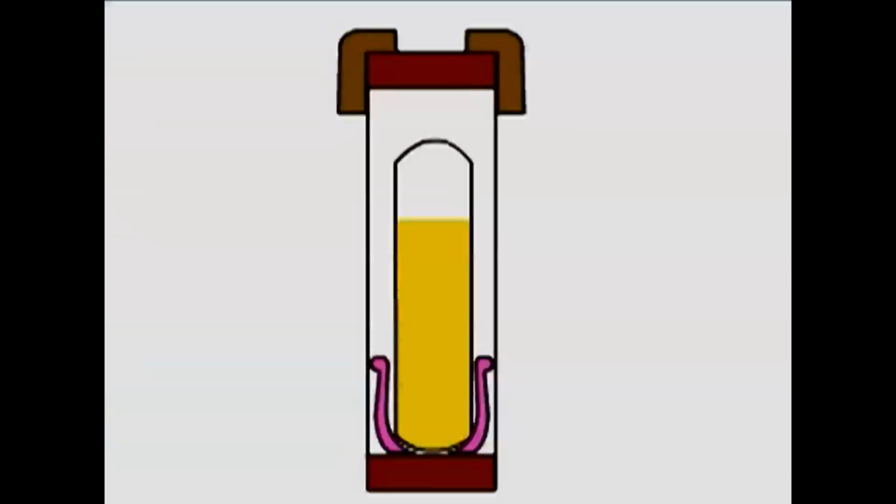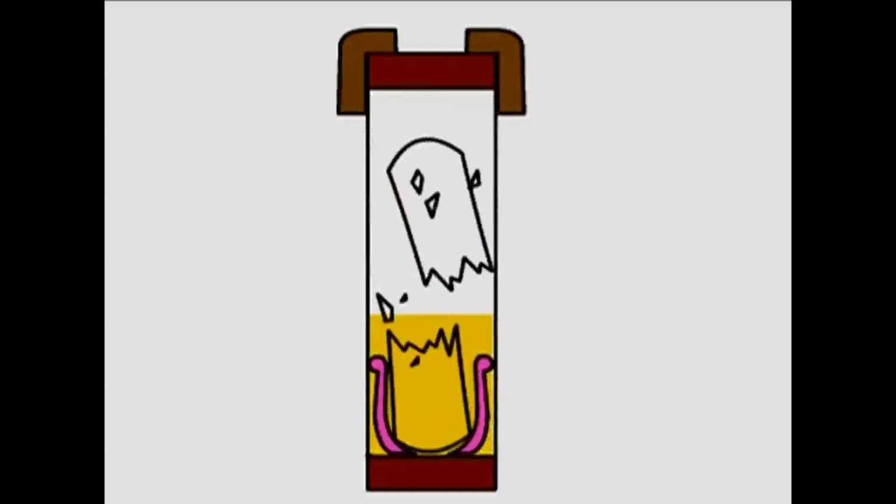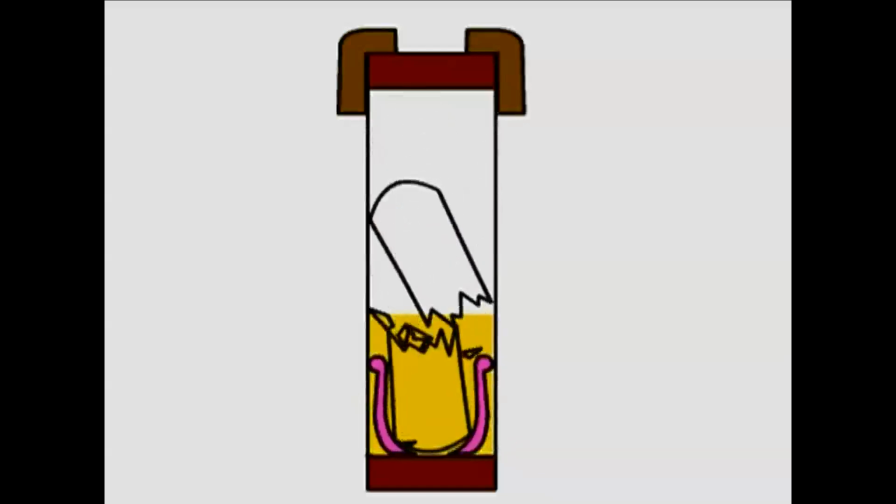After the completion of the autoclaving process, this ampule is broken aseptically and it is allowed to grow in an incubator shaker for a definite period of time. If we see that there is no growth of bacteria, then we can say that obviously all the spores have been killed during autoclaving, and it means that the entire process carried out during autoclaving was a perfect one. Okay.